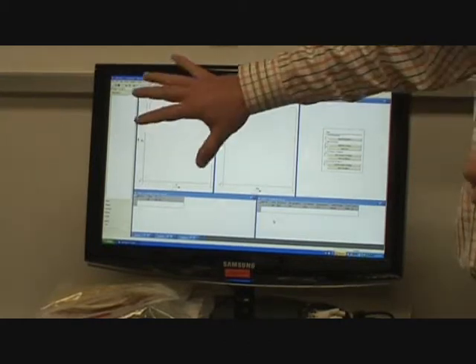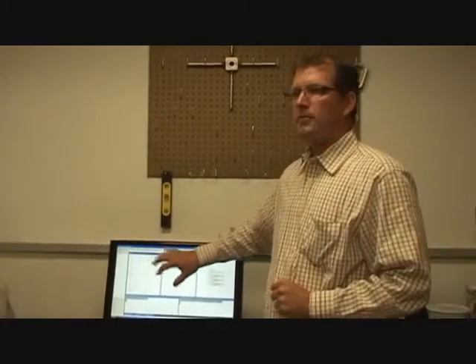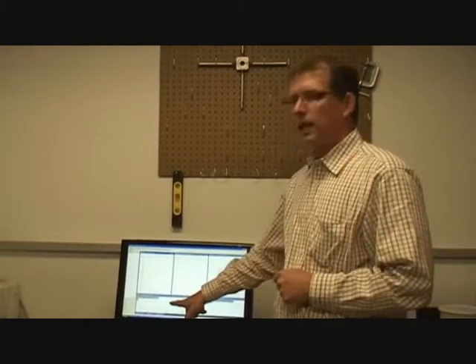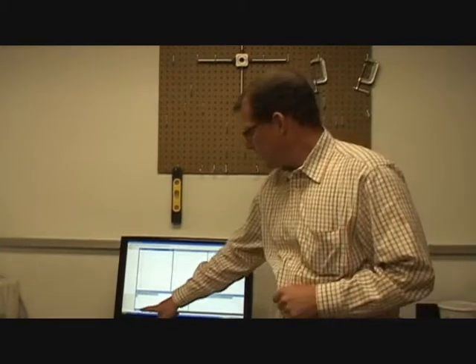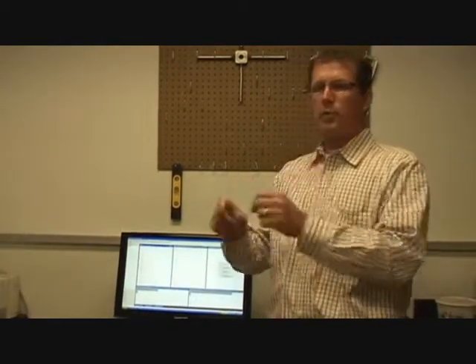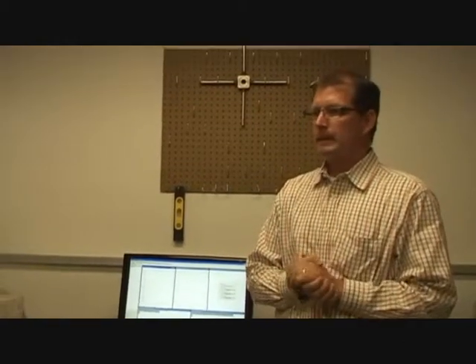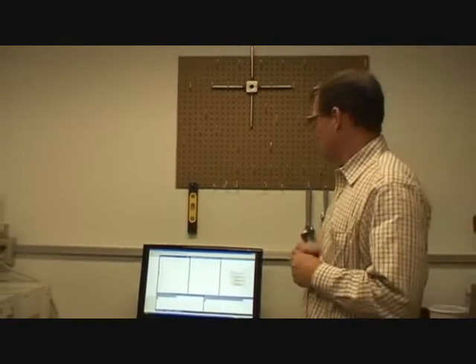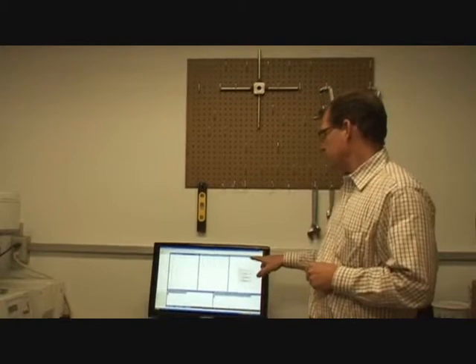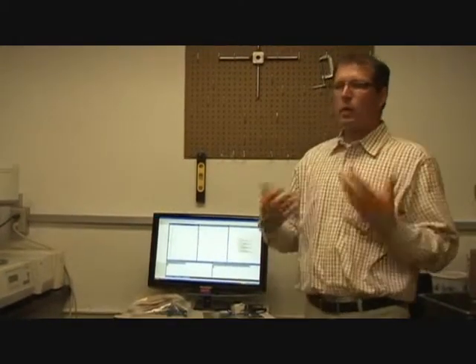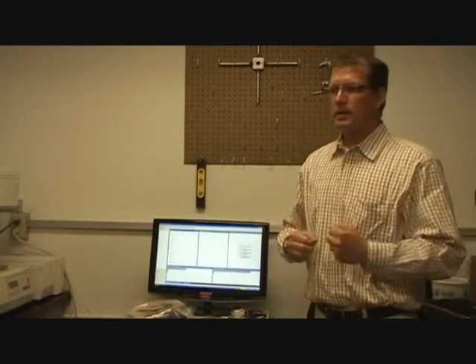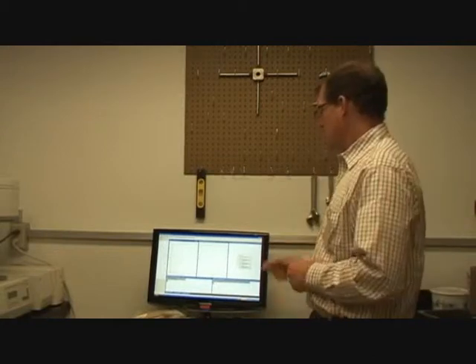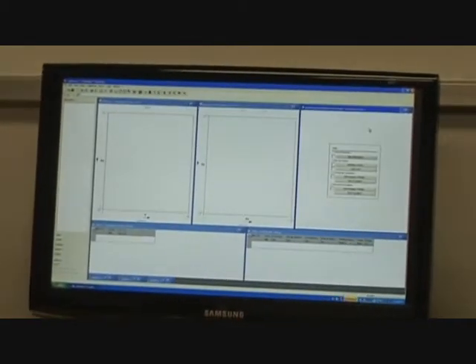When we first started talking, you remember that nice big blank screen — think of it like Excel. I opened up a template. This template has some graphs that will show what I'm actually running. It has some tables where it will store raw data, and it has a measurement window where we actually program what is going to happen — what amplitudes and things you're going to go for. Or we make things easier by using what's called an application workbook assistant. I want to run something, I went to standard templates, pulled up an amplitude sweep, and I want to try to run it — so just go to the workbook assistant, click on the buttons, and follow the procedure.